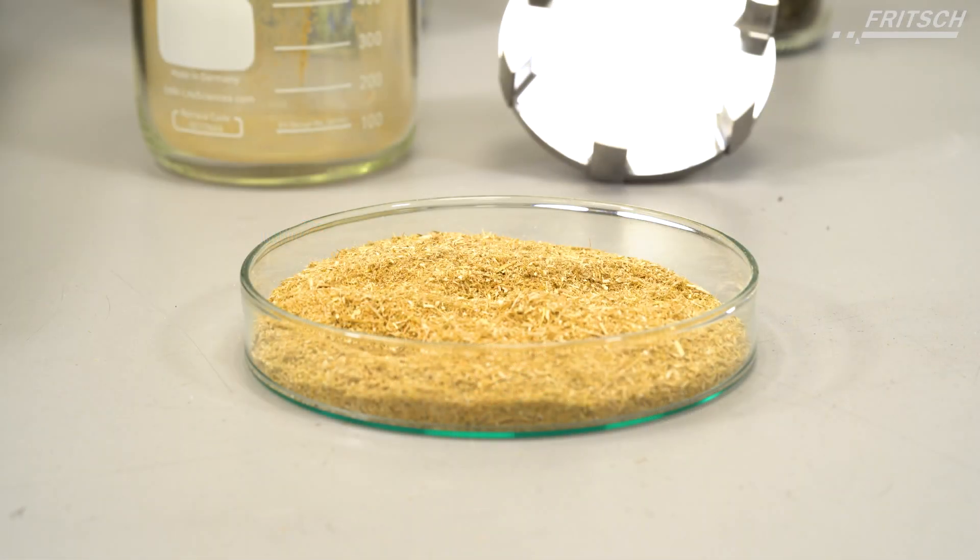With the impact rotor, you get quick results with a certain amount of fine dust that is created due to the comminution by impacting and shearing.